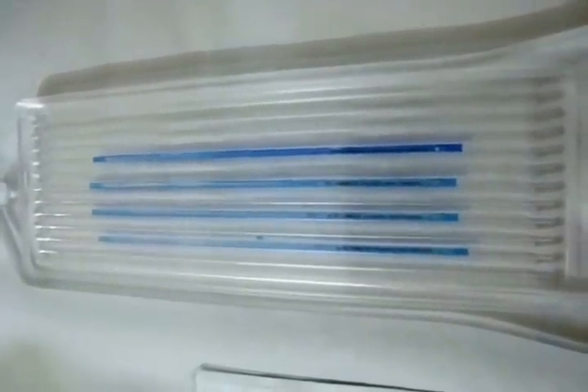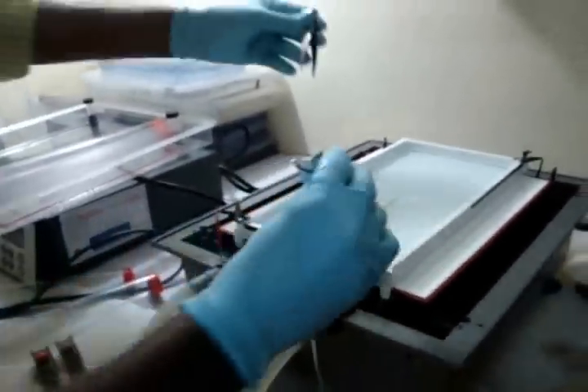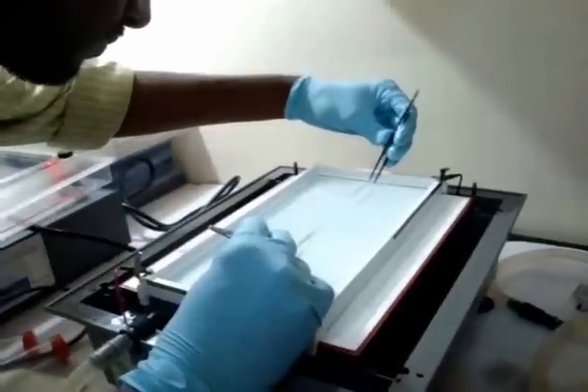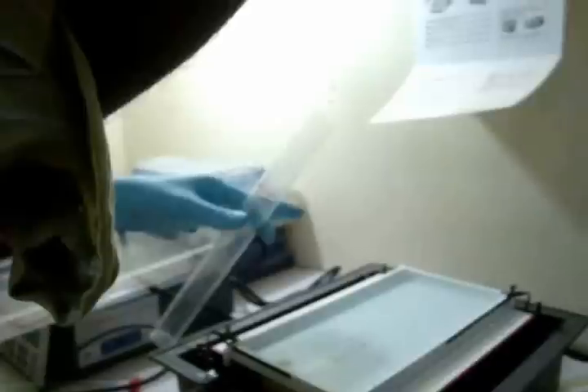The IPG strips are allowed to rehydrate at room temperature. A minimum of 10 hours is required for rehydration, but overnight is recommended. The rehydrated IPG strip is removed from the reswelling tray using forceps and transferred to the Immobiline dry strip tray for isoelectric focusing using the multi-form.